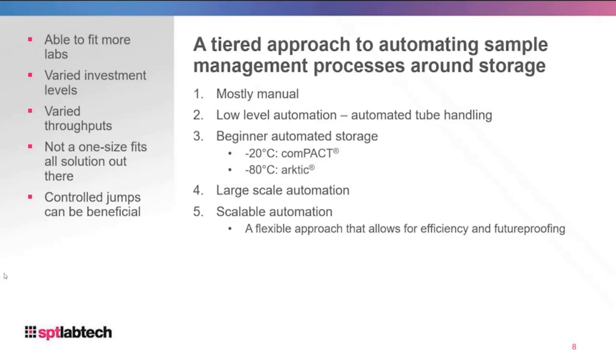Lastly, I'll just mention that this is more focused around automated storage and workflows around automated storage or just simple sample storage, but not containing liquid nitrogen level samples most of the time. If there are questions that are specific to a certain kit or a certain temperature zone, please ask at the end.